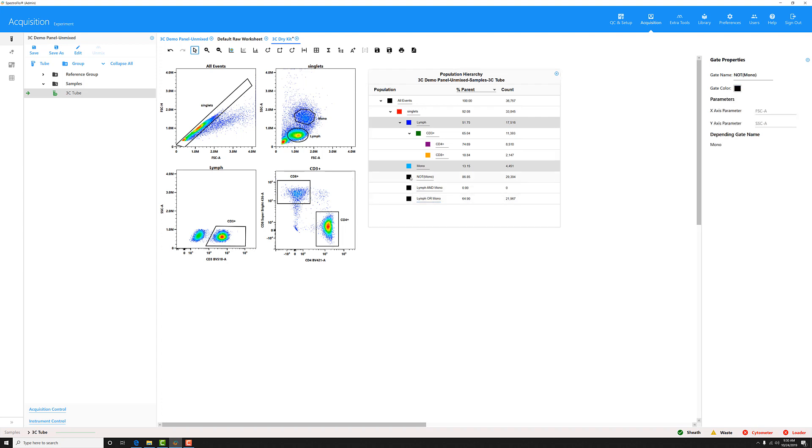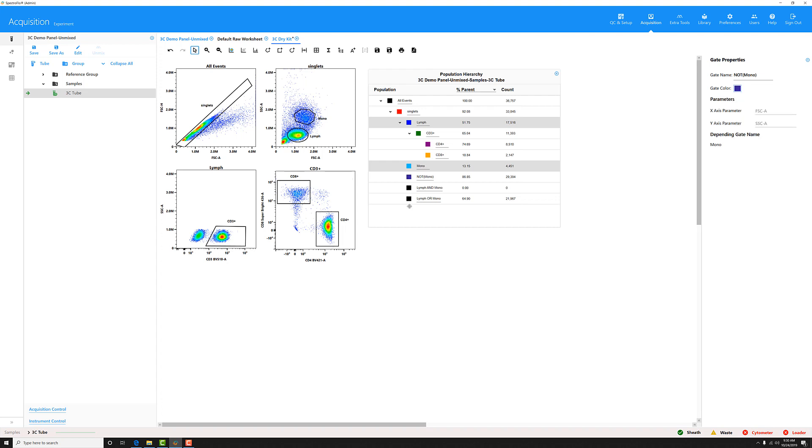If you want to change the colors, simply select the gate, and over here in the gate properties editor, you can click on gate color and choose whatever color you want that gate to become.